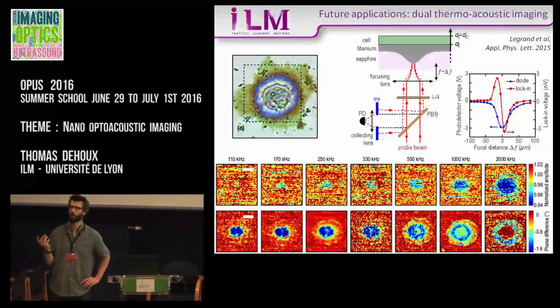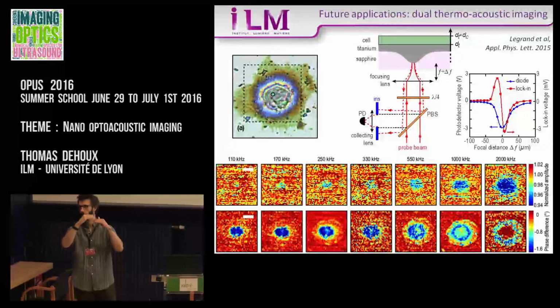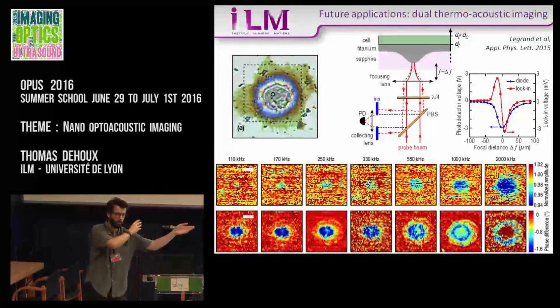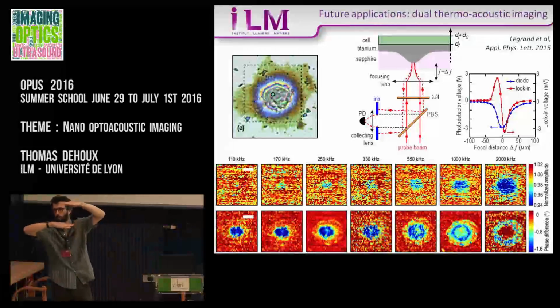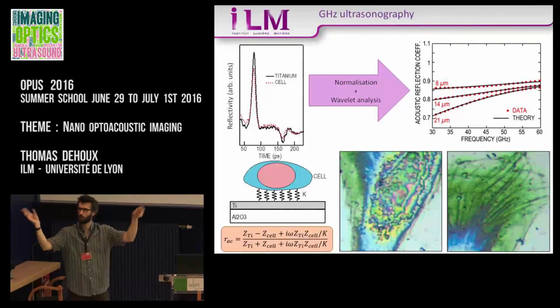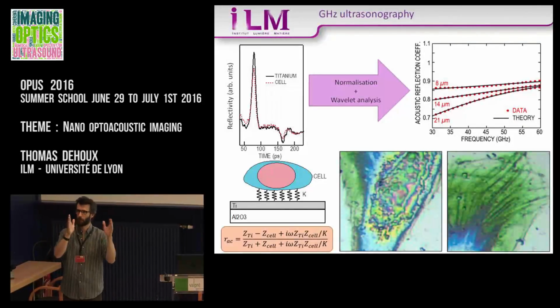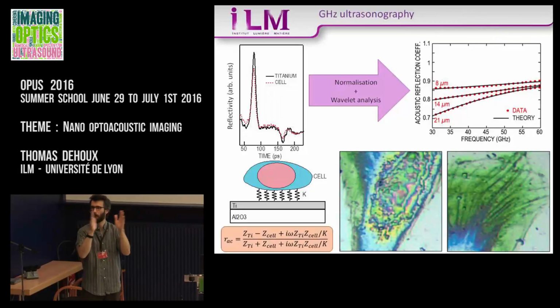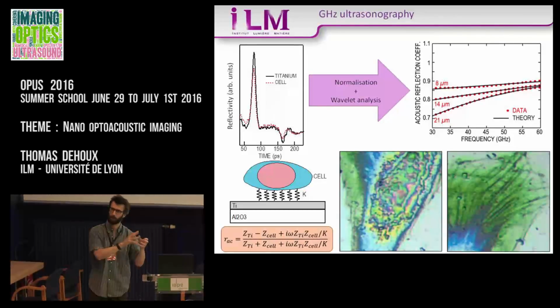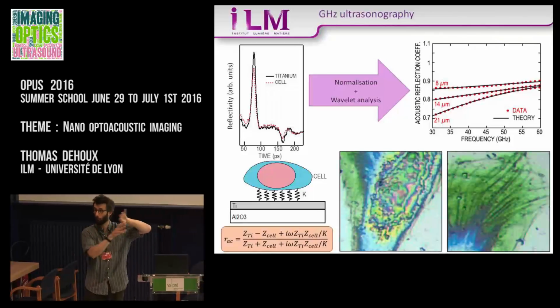I would say it's the frequency at which you can apply the deformation. With an optical trap, I guess you will just squeeze it slowly, quasi-statically, which is equivalent to the configuration when you have the cell in between two plates. Although with a trap, it's free. You don't have the plate. But you cannot apply fast deformation. So you're only sensing the liquid part of the rheological behavior of the cell, the low-frequency part.